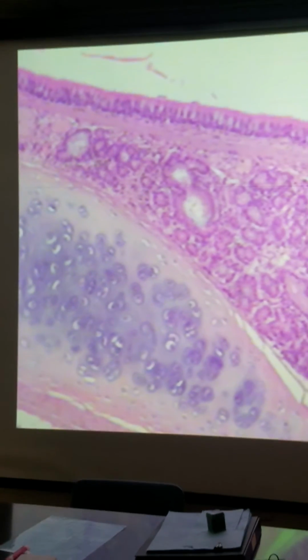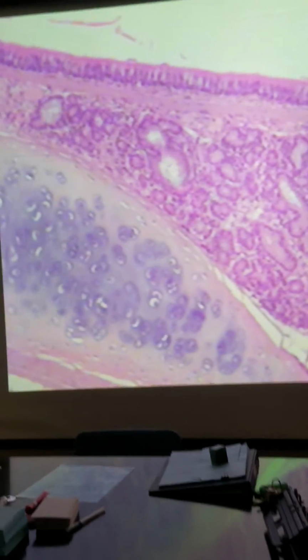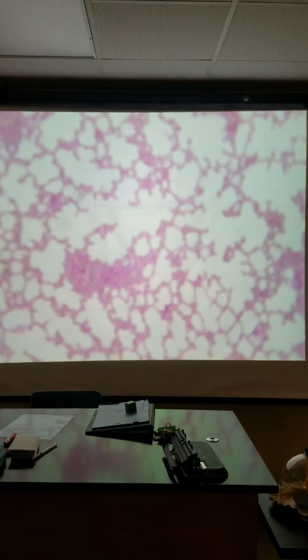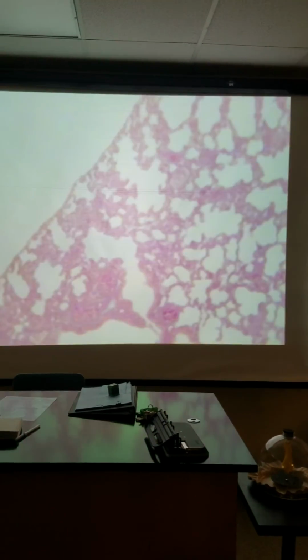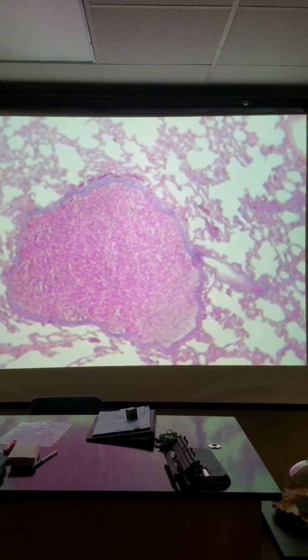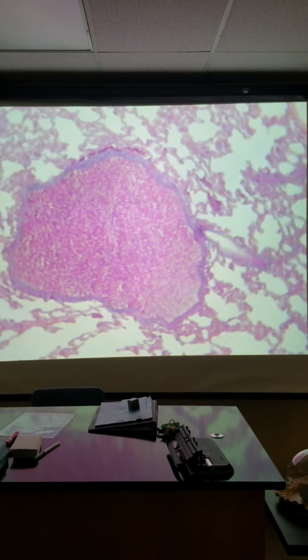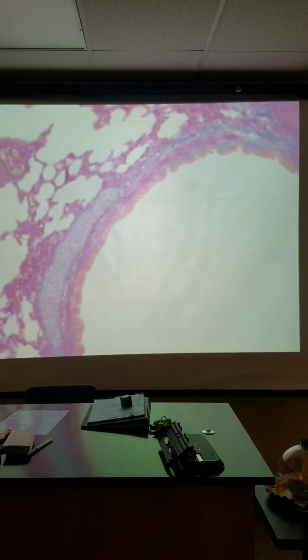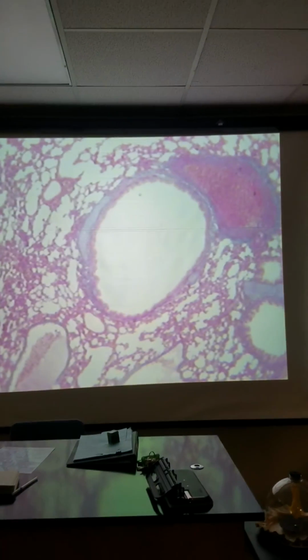Okay, let's go to a lung. Once you're in the lungs, those little repeating structures that you can see there, I'm going to look around for a nice bronchi. That with all the grainy goo in the middle must be a blood vessel of some kind. All right, so let's go here. Let's go down a little bit first. We'll go down so you can see a little broadly.